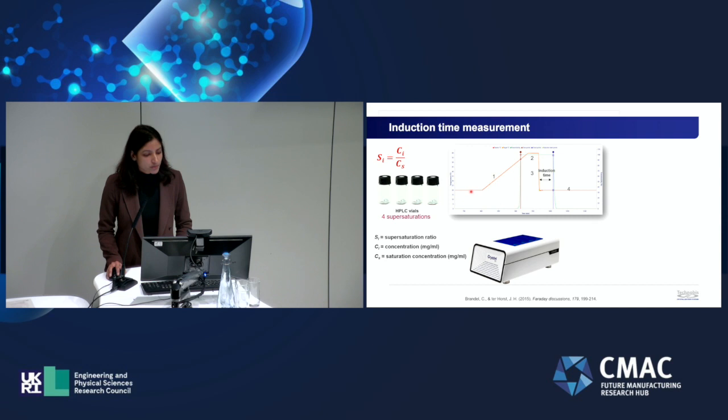For example, here we keep our solution constant at 20 degrees Celsius, so Cs is the solubility at 20 degrees Celsius. So the solutions were first heated to high temperature so that everything is dissolved, and then they were crash cooled at a very fast cooling rate of 20 degrees Celsius per minute and kept at the same temperature for a long duration. Then the time at which the transmissivity decreases indicates the appearance of the crystals, represented by this cloud point. And these steps were repeated more than 80 times for each supersaturation.